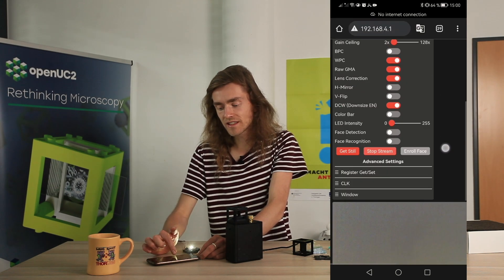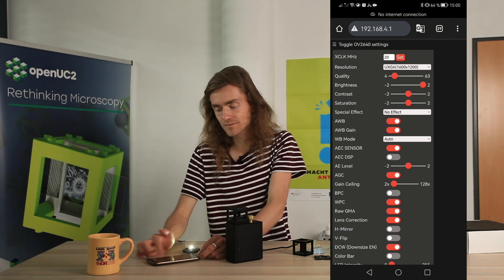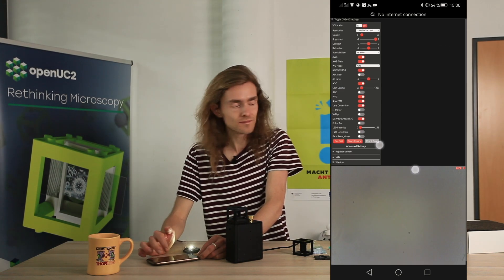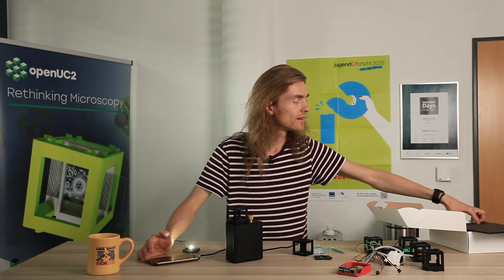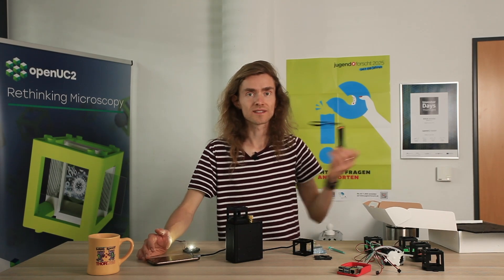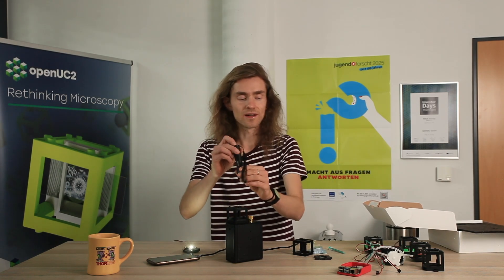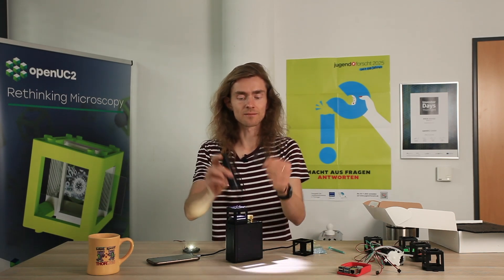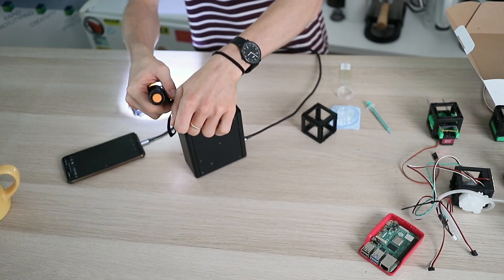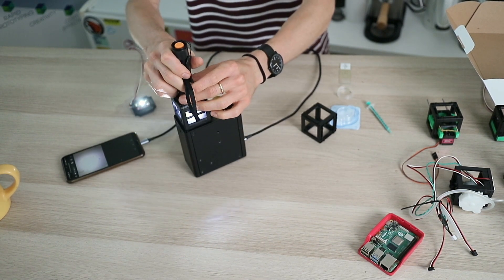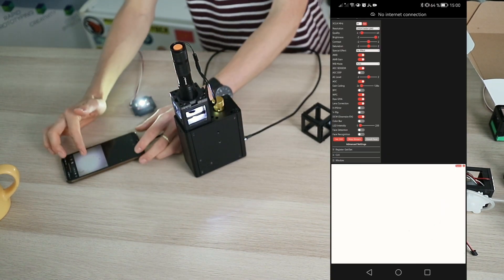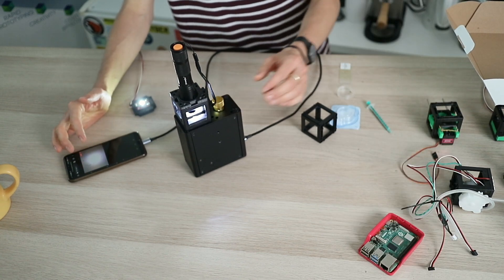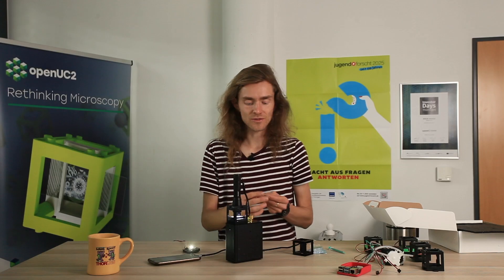You see this website is also based on an open source project. Then you start the stream and what you see here is the live stream of the camera. Right now it's pretty dark so we need to add the LED which is also inside the box — it's an ordinary flashlight. You can either put that here or just print a little adapter that mounts on top of this thing here so that you can mount the torch right here.